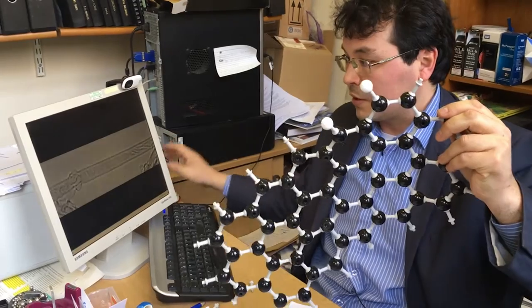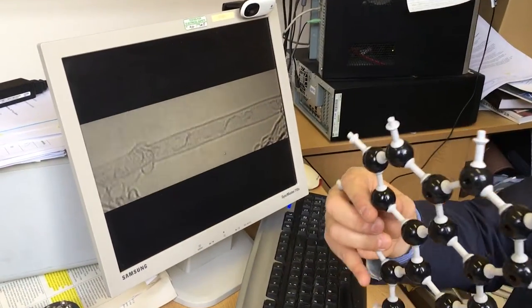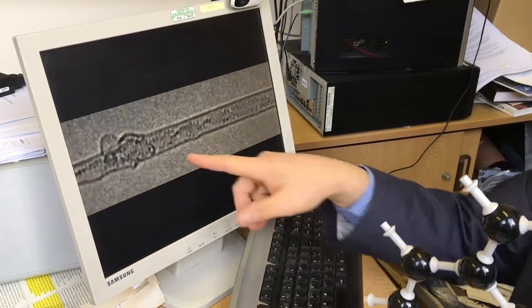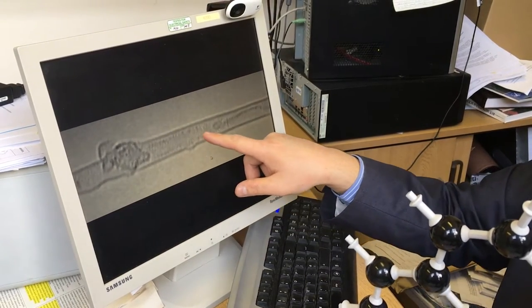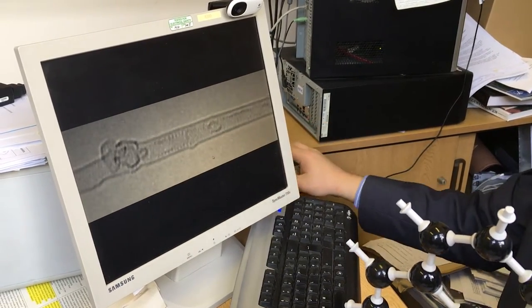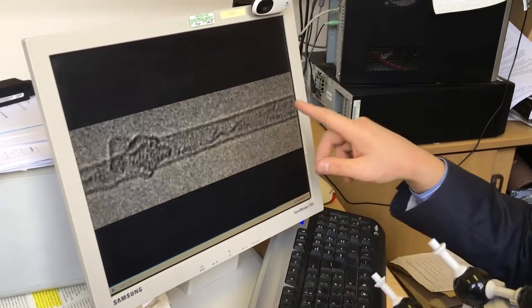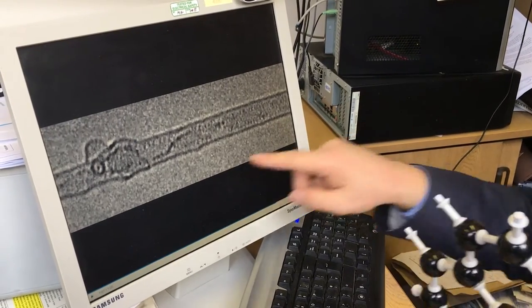That's the product that is formed in this reaction. You can see that the dark lines becoming longer and longer and longer because more molecules come and join to this end until eventually they transform into the nanoribbon of graphene, which is decorated with chlorine atoms. You can see these chlorine atoms as dark dots. And if you are very observant, you can see that this nanoribbon does not stay still. It also moves around and it twists in the nanotube.